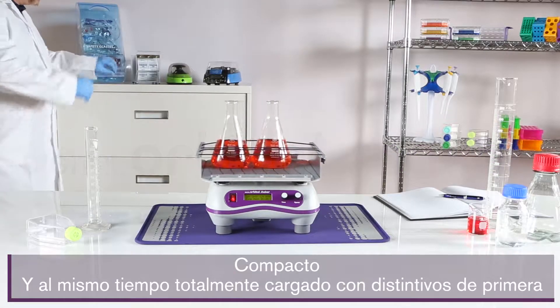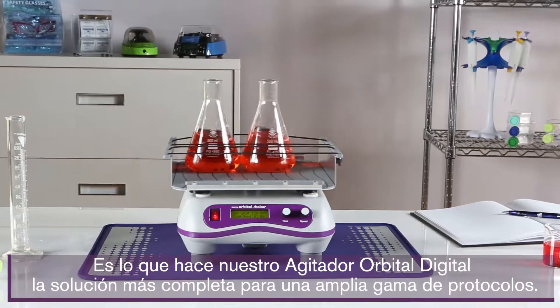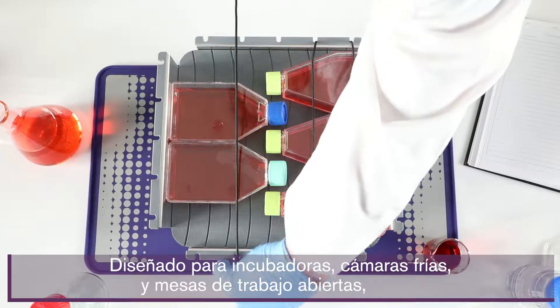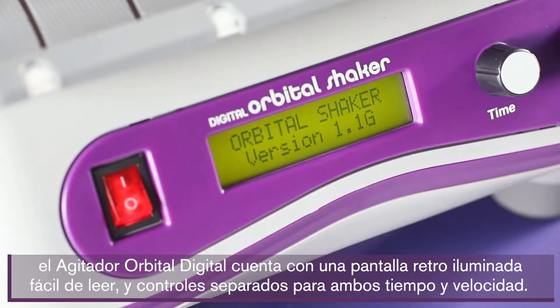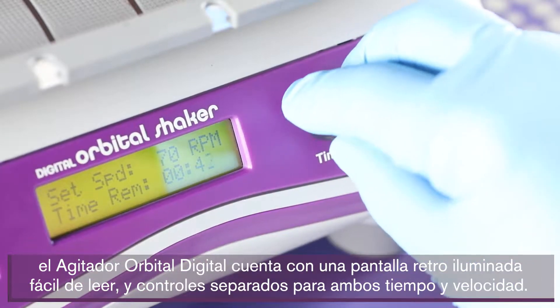Compact yet fully loaded with premium features, that's what makes our Digital Orbital Shaker the most complete solution for a wide range of protocols. Designed for incubators, cold rooms, and open bench space, the Digital Orbital Shaker features an easy-to-read backlit display and separate controls for both time and speed.